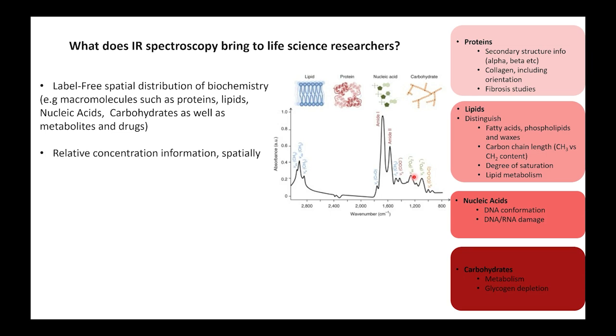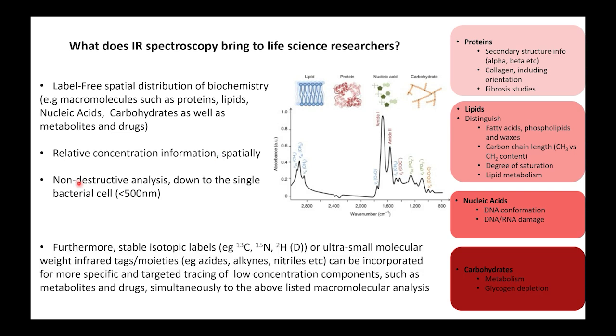And that really gives us simultaneous relative concentration of all of these key bio components or macromolecules, and this is delivered spatially at that submicron, sub 500 nanometer level, and importantly, it's also very non-destructive.